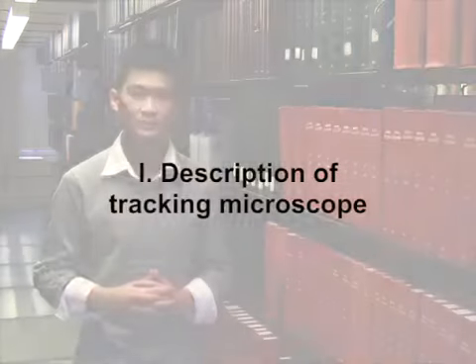A challenge of our video tracking system is that it generates an enormous amount of data that's highly dimensional. Our image processing and data analysis programs deal with this challenge by reducing the worm shapes into a set of independent components, which have comprehensively reconstructed the worm behavior as a function of only 3 to 4 dimensions.